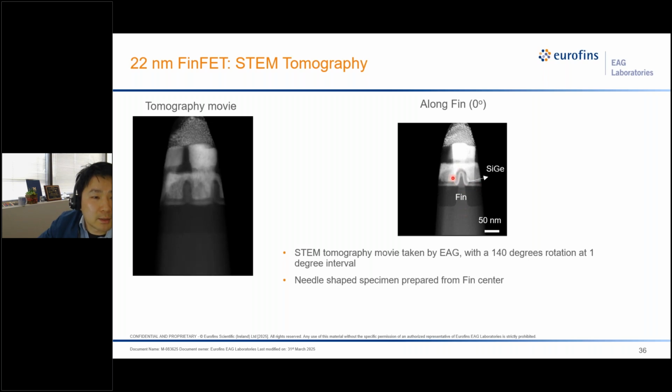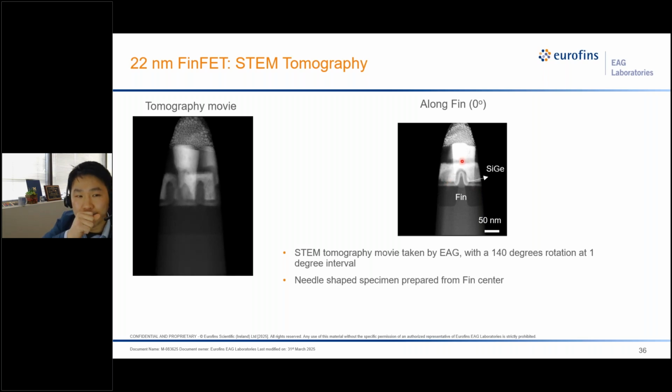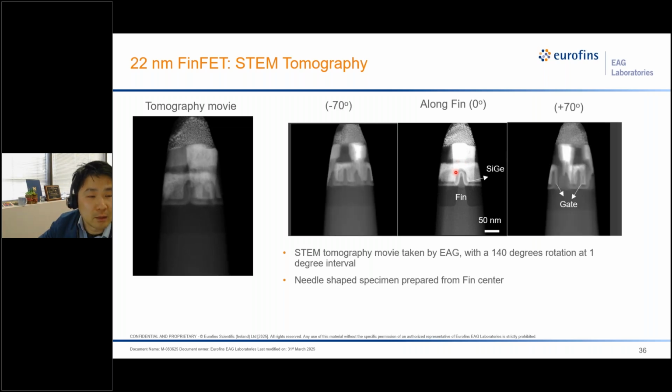You can recognize the diamond-shaped SiGe region in the middle, wrapping on the fin, and you have this U-shaped region that is titanium region in the metal gate. For the tilted view, we can see the tungsten actually shrink to a thin blade and touching right on top of the SiGe region, as shown in here. And the gates are shown as arched doors with this shape.